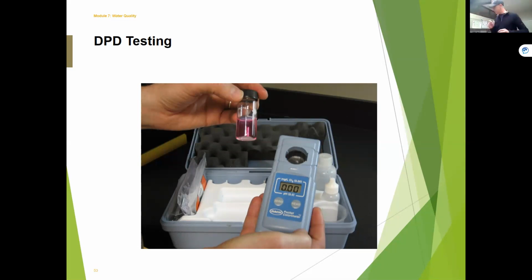The one big thing is that you want to make sure it's clean. I never want to see people take a paper towel and be really rough with it. These are really expensive glass vials. They should have special chem wipes so that you make sure it's nice and clean and dry. I always look for scratches, because a little scratch is going to really mess you up. The cleaner your vial, the more trustworthy your reading is going to be.